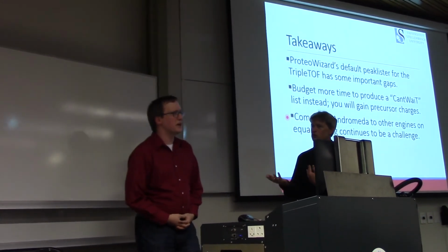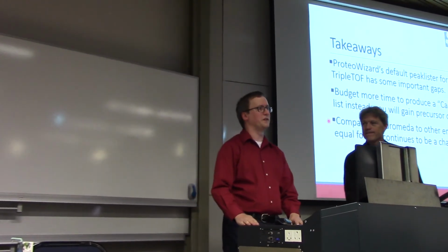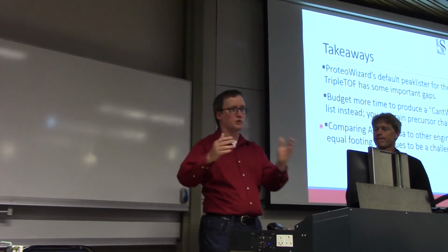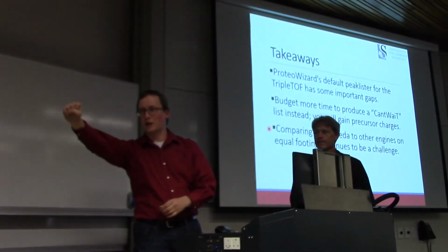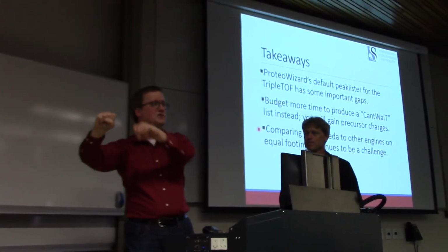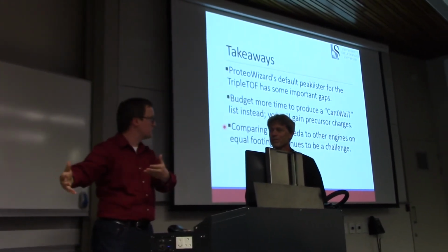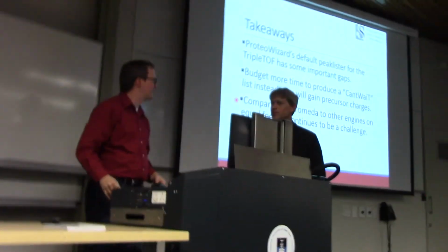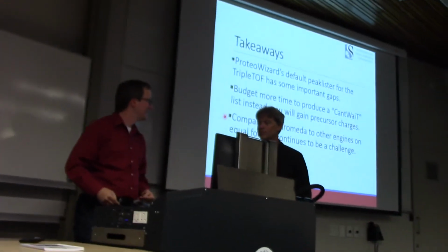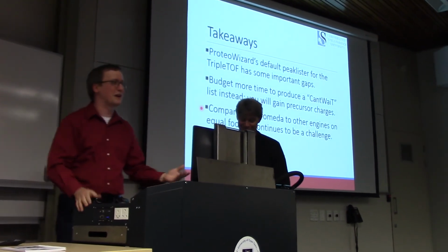Well, I've spent some time with identifications in the SCIEX world, right? So I've worked with data from their Q-trap, a Q1 like we have here, a collision cell followed by a trap. I've used data from those when I was working in federal trials for people trying to prove they had ricin in their refrigerators, right? You can do it. You can do identification with a Q-trap like that.